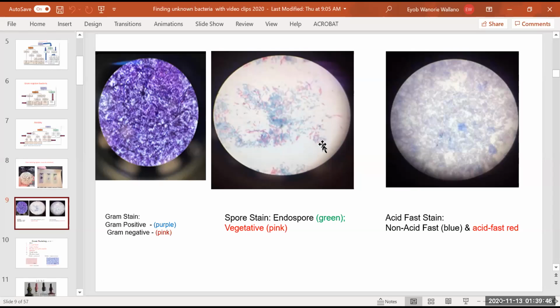Here you are going to see, look now, spore forming bacteria. Do you see that? Vegetative is red, spore is there. So they know it. Their bacteria is already a spore forming bacteria. Which one? It can be Clostridium or Bacillus. That's all. You see, the very easy technique. They know it.